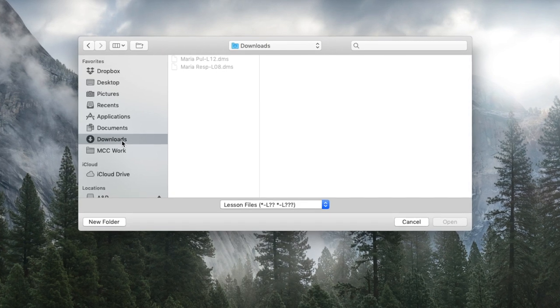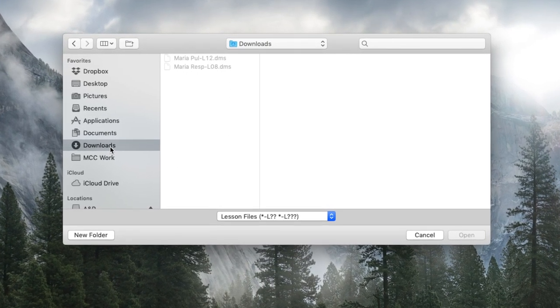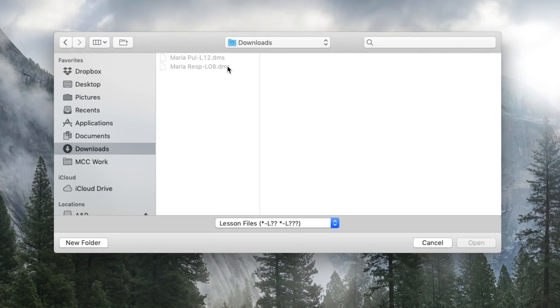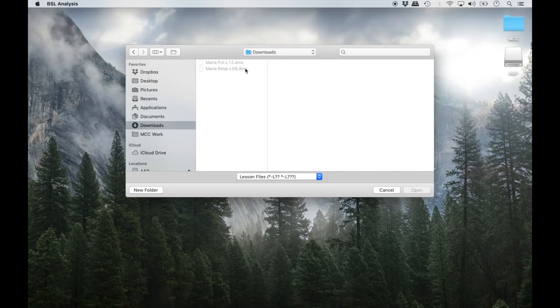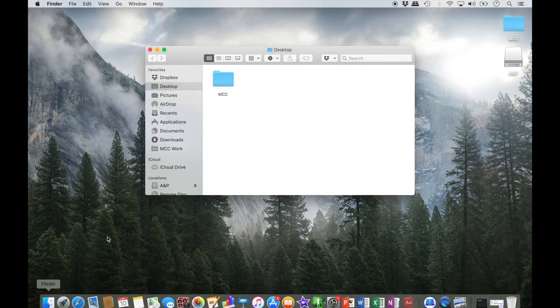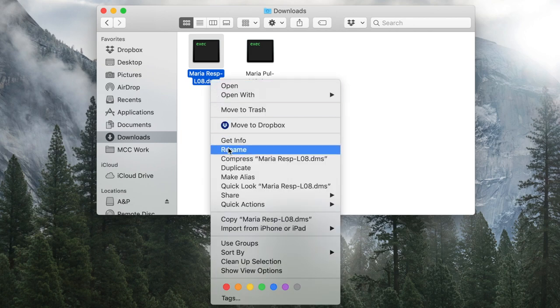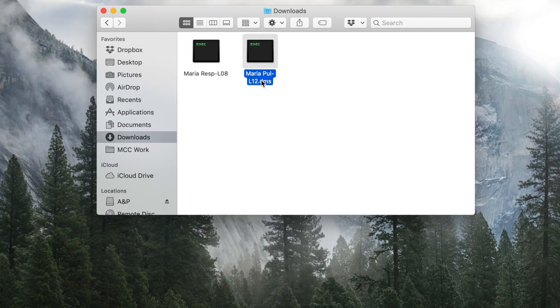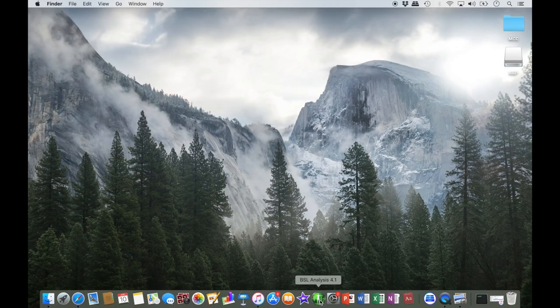If you get to this point and see your file but are unable to select it, this is generally due to a change in the file extension done by the server. As stated on page 14 of the instructions, to correct this issue close out the BSL application, open the folder your file is in, and right-click on the file name to rename it, deleting the dot DMS extension. Make sure your file ends with the dash capital L zero eight extension or Biopac will not recognize it.